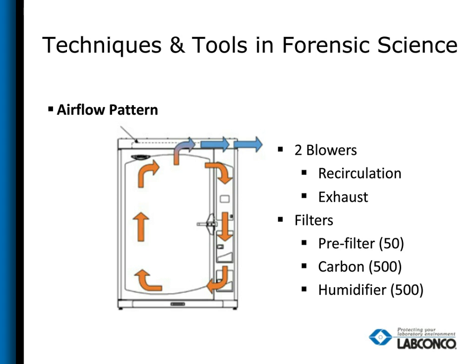What happens is the technician or the examiner will be using an automated system. They'll put their glue in, they'll put their evidence in, they'll start the process, and they'll get taken away for other duties and tasks. They know the system will stop, exhaust all the CA fumes, and then turn itself off, and they can return at a later time. What they don't realize a lot of times is that the heat plate does not cool back to room temperature. It's still retaining the heat. The tin could have extra glue in it. It's going to start the volatilization process all over after the exhaust has stopped.